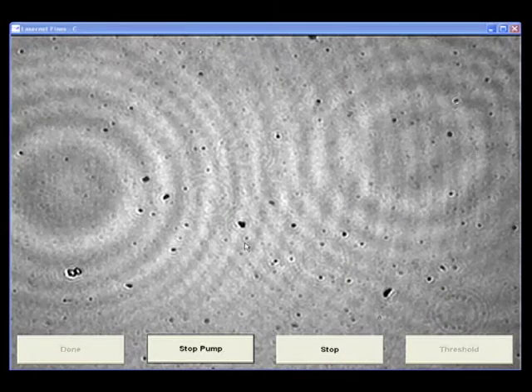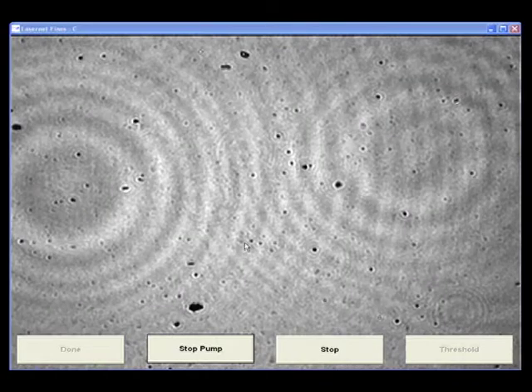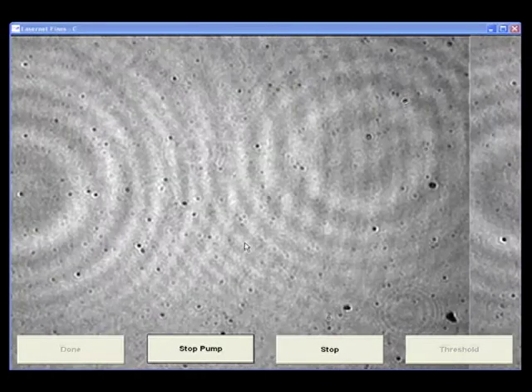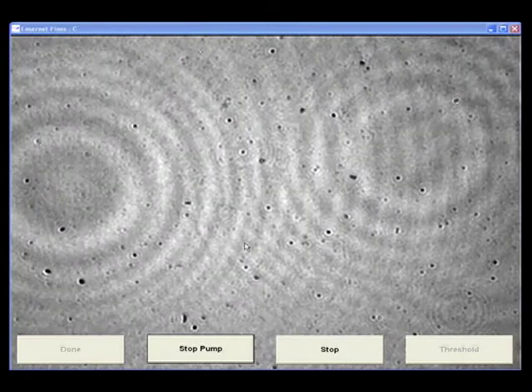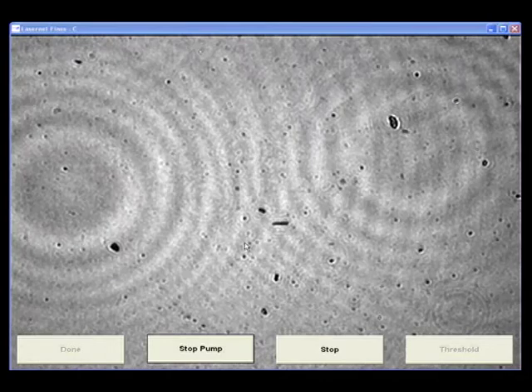The LNF utilizes direct imaging technology instead of the traditional light blocking technology found in other particle counters. Here you see particles as they flow through the patented flow cell.